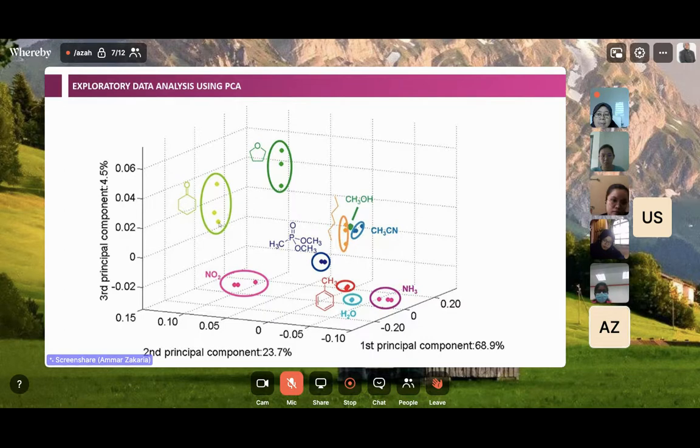Let's say if we find these samples are correlated to each other, it will group them closely. If these three dots are quite close to each other, it will group them closely, right? The problem that you will face is that the orange, blue, and green are together, right? Of course, from the experiment, you know that they are from different types of gases, right? When we put in the grouping, you can see that they are grouped with each other, right?